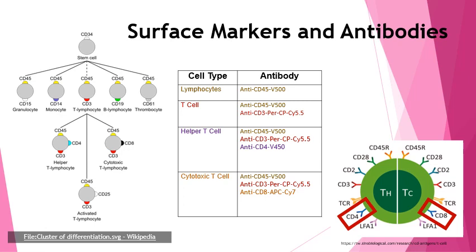So basically what this slide is showing you is the layering of antibodies in your antibody batch, or antibody cocktail, as it's called. You layer them to get all your different cell types and your different cell type subsets as well.